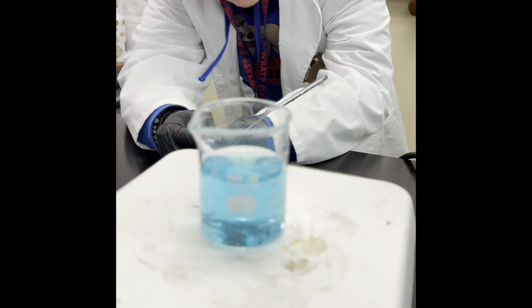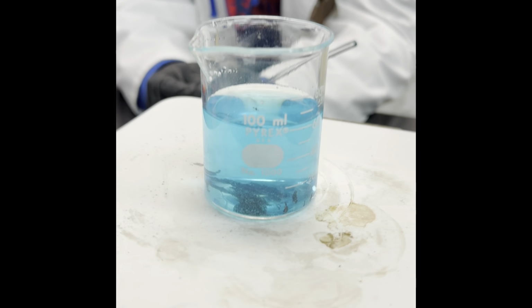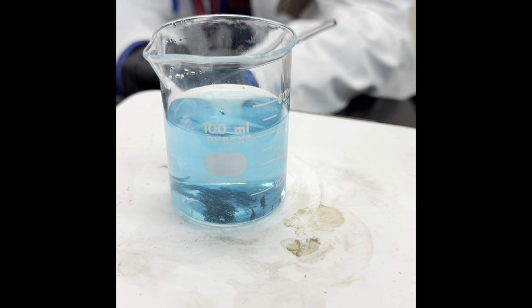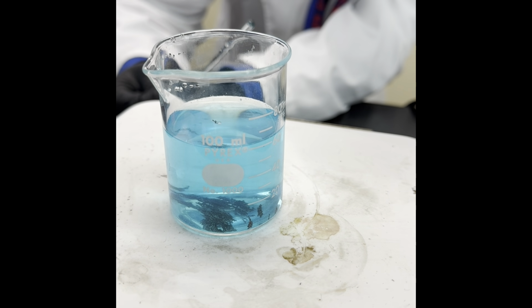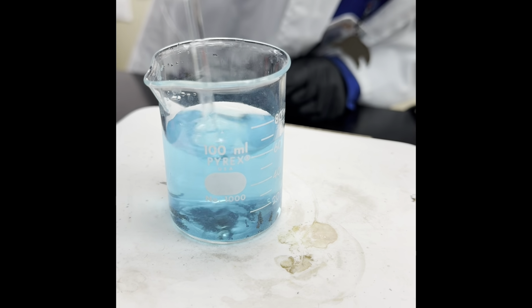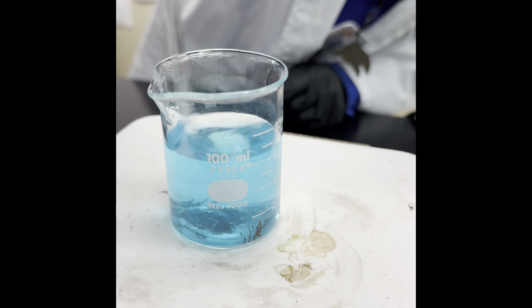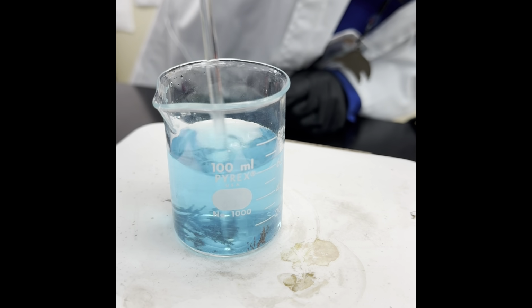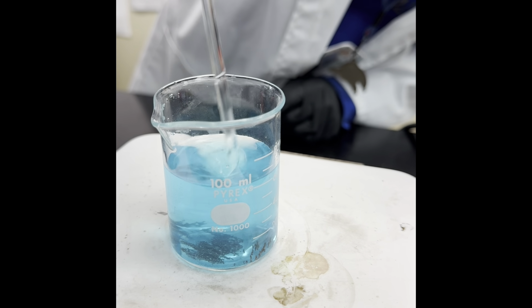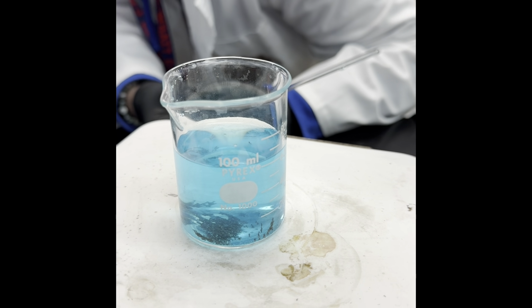So let's see, we're looking for a color change in both the solid iron at the bottom as well as the solution. So we're going to see if we can get that to happen. I did try this time to use a little less iron because I was finding my reaction wasn't going to completion. You all are going to be learning about that in stoichiometry, and how important those proportions are.